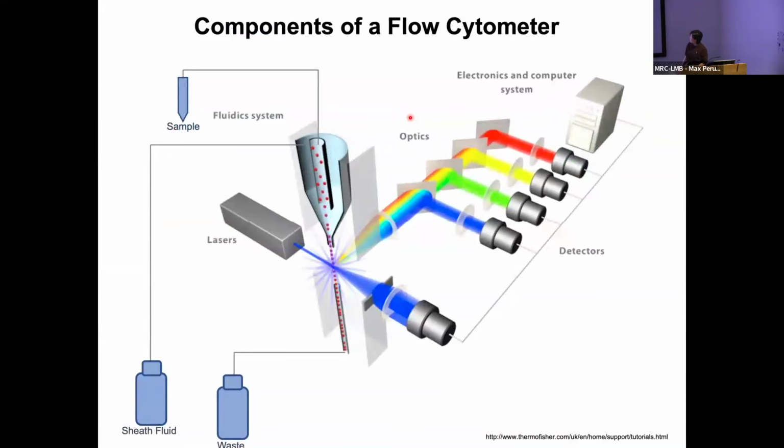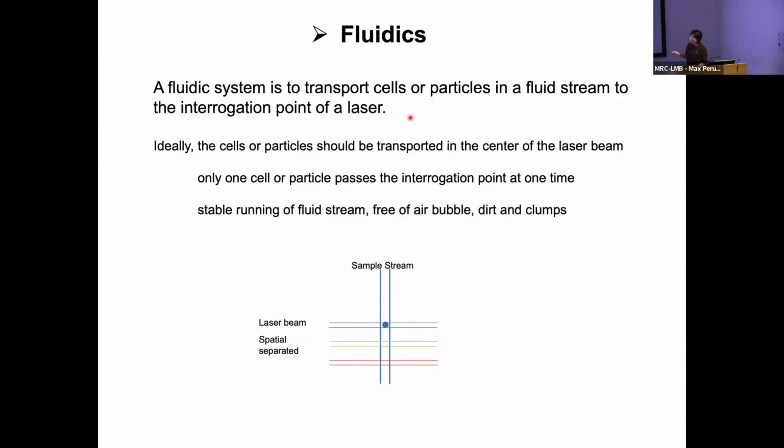So let's talk about the components of flow cytometers and see how it works. First, let's have a look at fluidics.